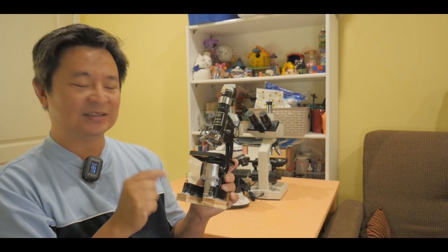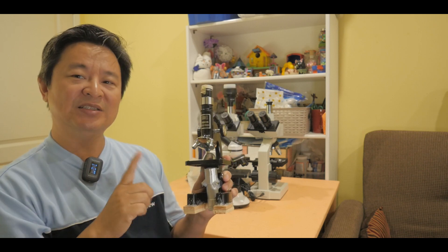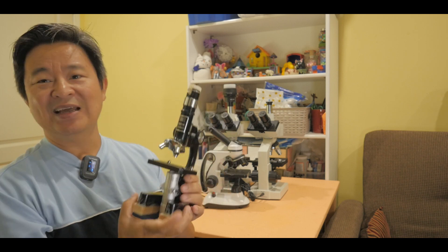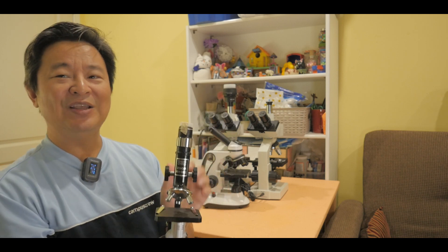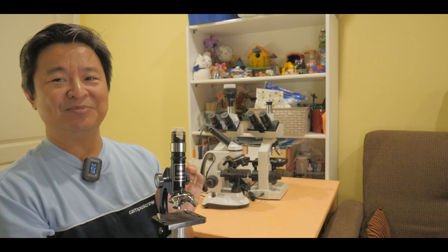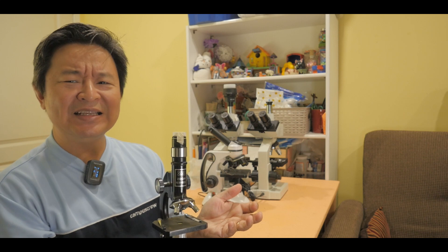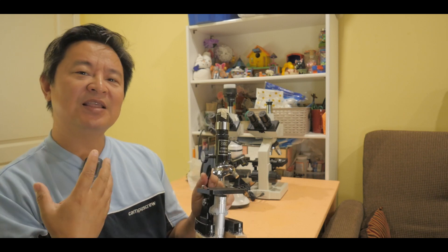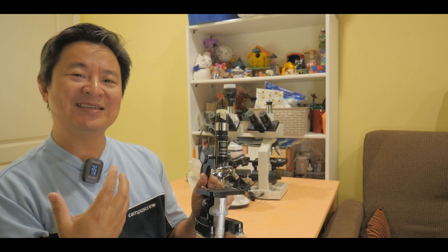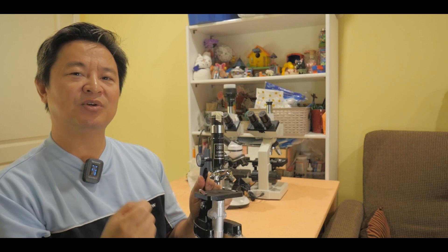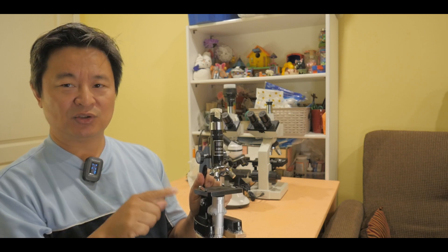So the next thing, of course, getting the LED lights. Now, the LED light that comes with this typical type of plastic microscope, the kids microscope here, is not very good either. So when the kids are learning from this type of microscope, they're gonna have a bad experience. They're gonna say I can't see any cells or I cannot see that tissue that you're referring to. So that's the thing. You don't want the kids to realize, oh, what am I looking at? You want them to have the best experience as possible and so you want to get the best microscope.